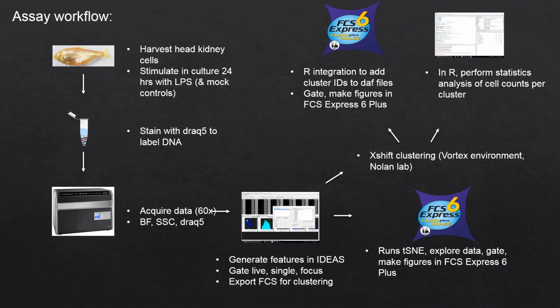You can do that in IDEAS. And then I export FCS files, which will feed into the clustering environment. Or you can go straight into FCS Express and run tSNE to do some sort of preliminary exploration of the data. Or if you get tight enough cell clusters there, that can be a good endpoint, because then you can gate and quantify.